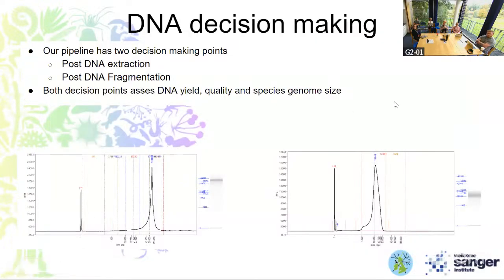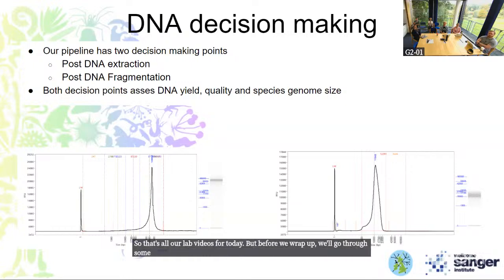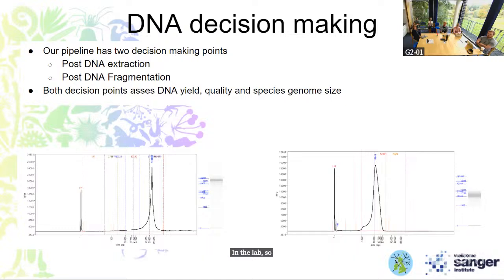So that's all our lab videos for today. But before we wrap up, we'll go through some of our DNA decision making in the lab. So our pipeline has 2 decision making points. So post DNA extraction, we assess whether an extraction is acceptable to pass forward into DNA fragmentation, and through which route of DNA fragmentation we're going to take it.